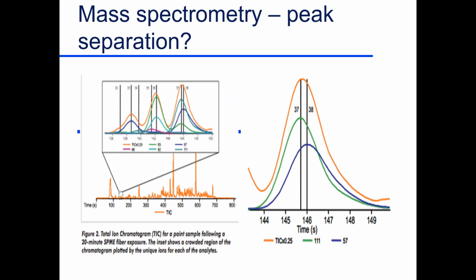It's a little bit of lines and whatever that come up, and maybe not overly clear. But this is the chromatogram that comes out of the gas chromatograph. So we're coming along, here's the compound, here's the compound. And we're interested, let's say, in just one portion of this, a little portion right here, which is blown up there. And in fact, only this last one tends to be blown up here. It didn't take the green one for discussion. It took just the two top lines for demonstration.